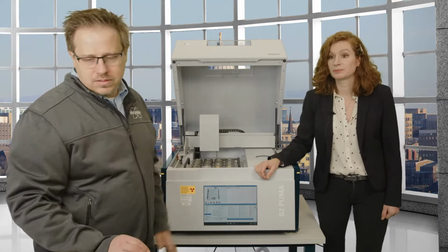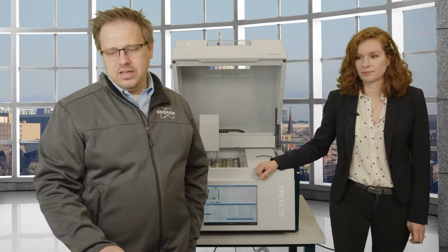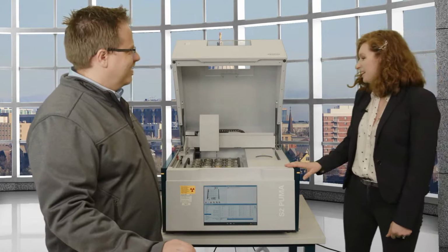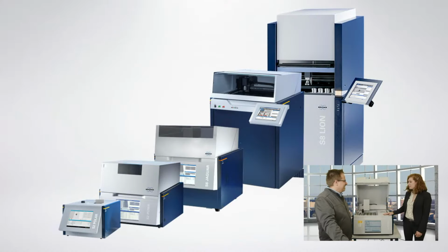All right. Next question is from Diana. Why do you have so many different machines? Because I think it's important to, first of all, there's WD and ED XRF.